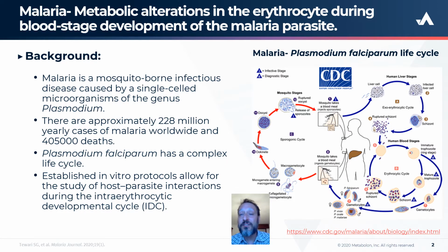In fact, as I said previously, Plasmodium falciparum goes through several life stages. And to generate synchronized parasites, the cultures were passed through magnetically activated cell sorting columns and purified every 44 to 48 hours for 4 days before the initiation of the experiment. The researchers used blood smears and light microscopy to monitor parasitemia and synchronicity, and additionally, they also conducted PCR to confirm the absence of mycoplasma.